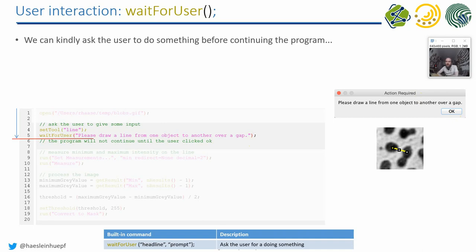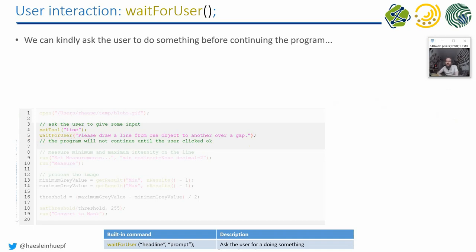So I can then draw my little line, and when I click on OK, then the rest of the program will be executed. And I can, for example, print out the length of the line or the signal along the line, stuff like that.